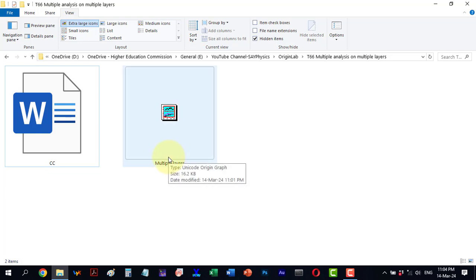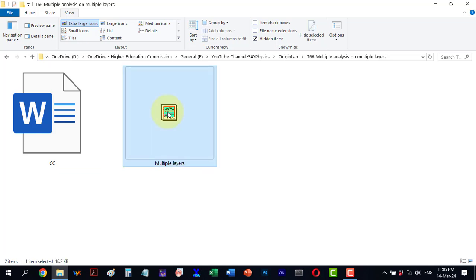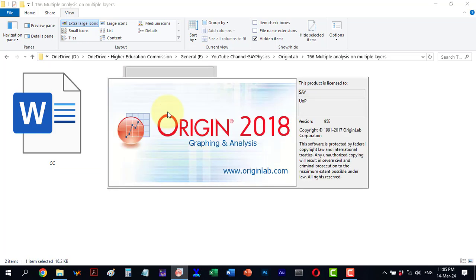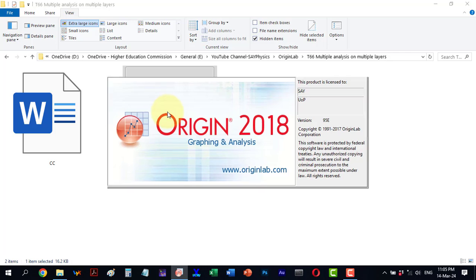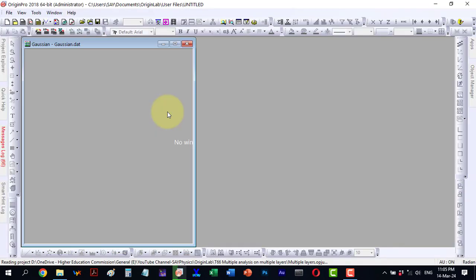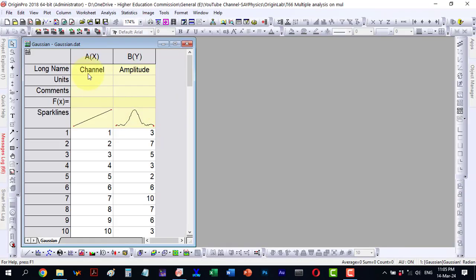In this video we will explore performing various analyses on identical data using multiple layers in Origin Pro. Let's open the project. Here we have two column data.